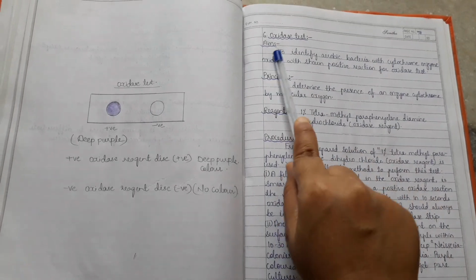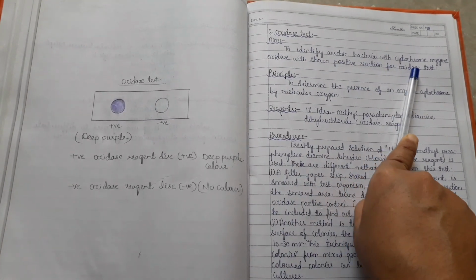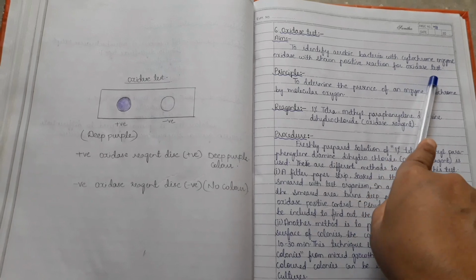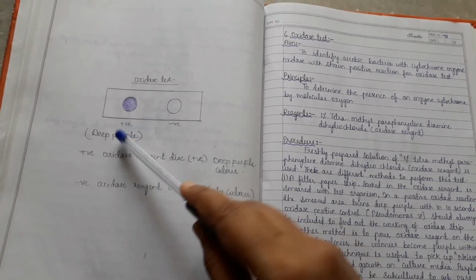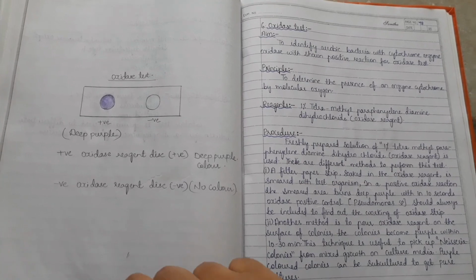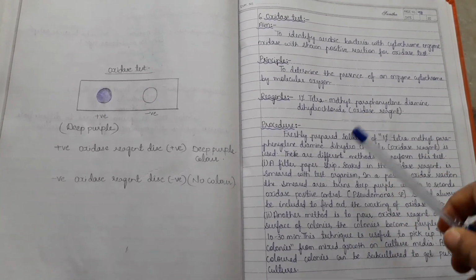So coming to the oxidase test, to identify aerobic bacteria with the cytochrome enzyme oxidase, which show a positive reaction for the oxidase test. So here, deep purple color shows the oxidase positive test. So this is the principle and the reagents, and this is the procedure.